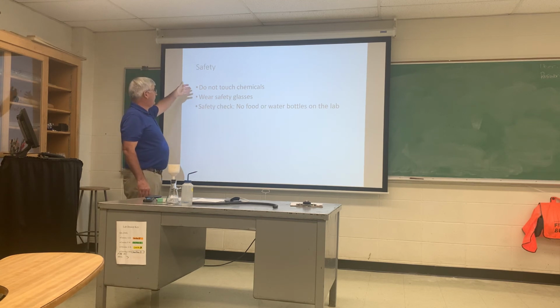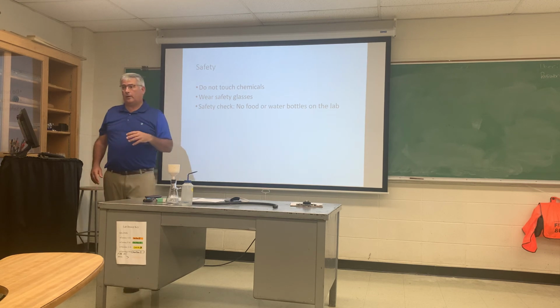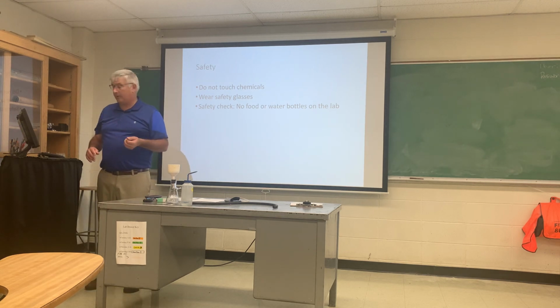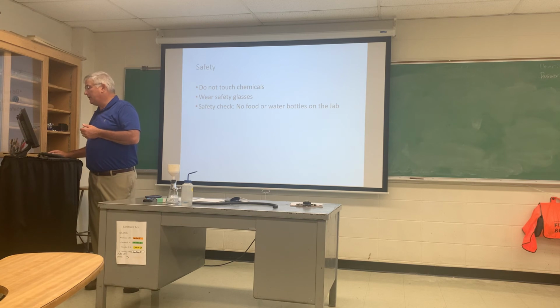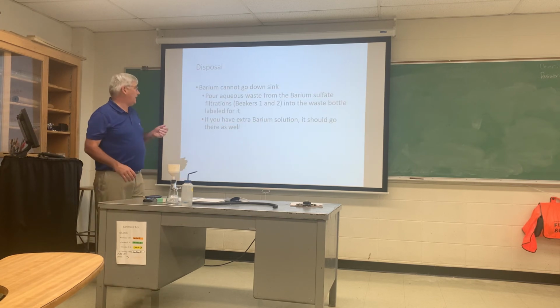And then a couple things, don't touch chemicals. Just a reminder, we've got to wear our safety glasses, make sure that you got them on, and no food, drink, or water bottles or those types of things in the lab. Please leave those out in the hall, guys. And we'll have a container for the barium. It cannot go down the sink.